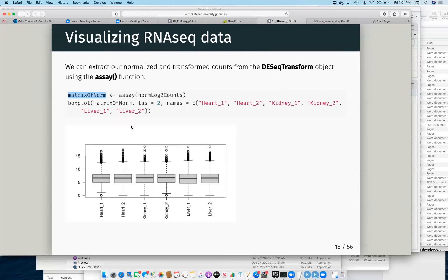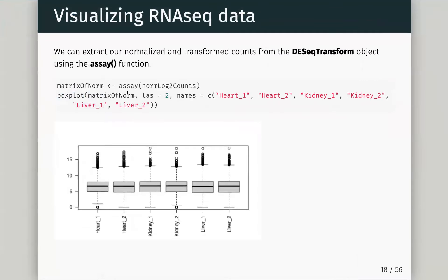In this case, what we want to do is check the normalization, and we can quickly do a box plot from base R — we'll take our matrix of normalized values, tell it to orientate the labels sideways, and give it the names we want to plot. Now I have my box plot and we can see that the distribution of normalized counts looks pretty good. Maybe this one sticks out a little bit and looks different.